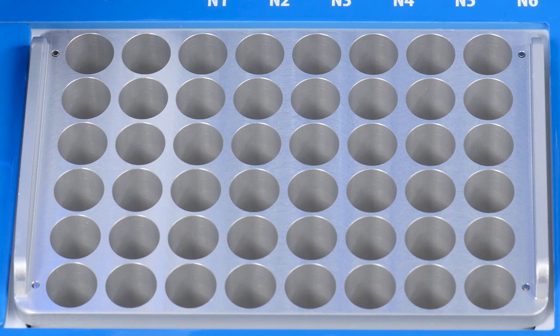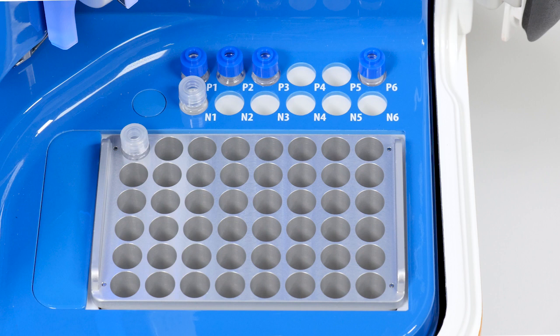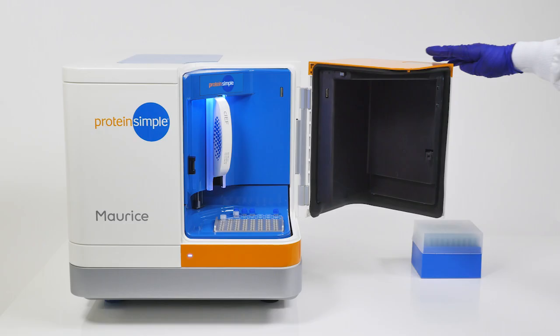The last required reagent is a second glass tube containing 2 milliliters of distilled water with a clear screw cap placed in position N1, the first position in the second row of reagents. Insert your Maurice sample vial into the 48-position block in position 1. With your cartridge, reagents, and sample loaded into Maurice, it is now time to close Maurice's door and get started with the software setup.